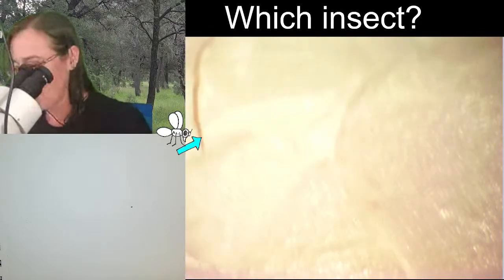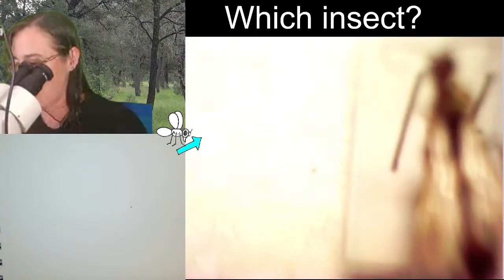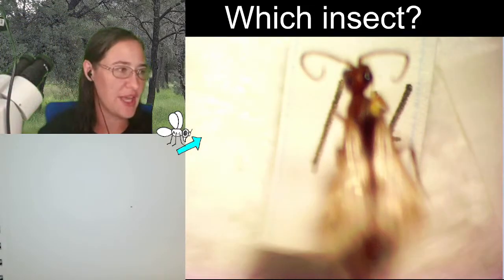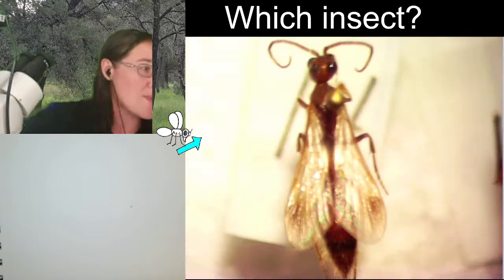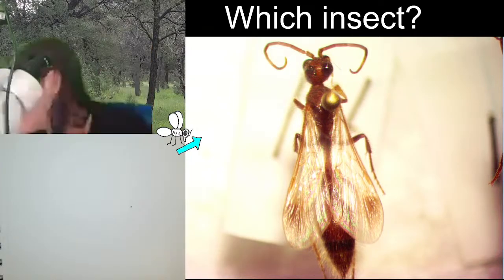So after seeing all three of them, the velvet ant, the carabid, and the tiger beetle, I guess the question is, which one would you like to kind of take a deep dive on and check out? I do know that the velvet ant that we're looking at here is significantly different from the velvet ant we did before. We have sketched all three of these families in the past, but you did ask for me to pull some specimens that were recently pinned.